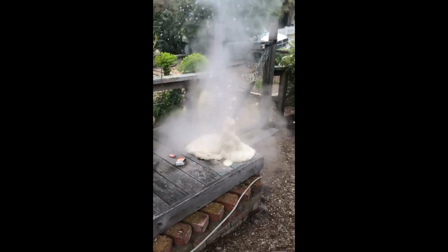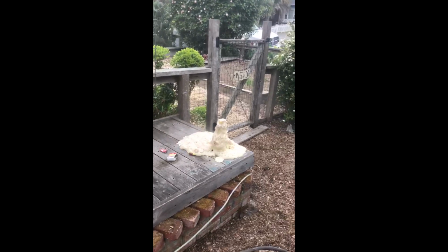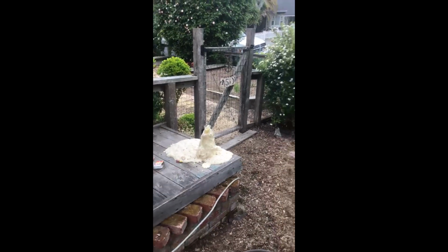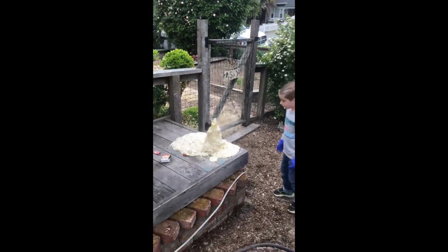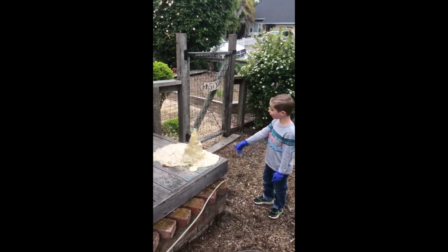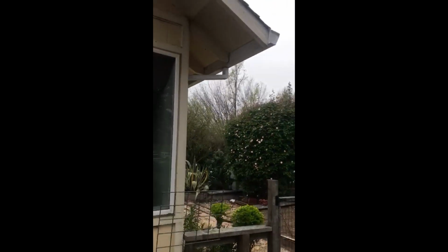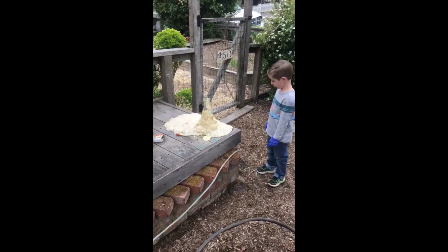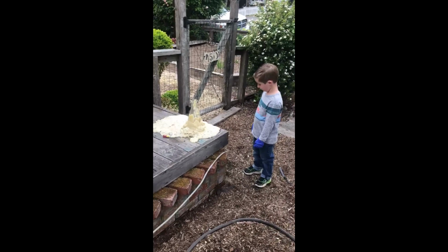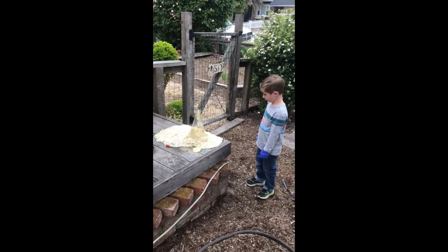There we go. Okay, as you can see, it's an exothermic reaction that creates a lot of steam. It's very hot. So what do you think, Graham? That one didn't go as high as the last one. Yeah, it turns orange. The last one we did actually went higher than our roof. And I think that was with sodium iodide. So that's still cool. It's a cool chemical reaction. I'll put a couple instructions down below so that you guys can do it.